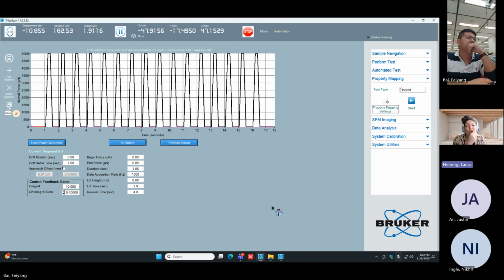It's hard, especially because your stages are not encoded, so yours might not line up perfectly, unlike what you might see on the 980. But it is possible that you could do many property maps overnight in an automation instead. So you can combo them, which makes the whole thing very strange.